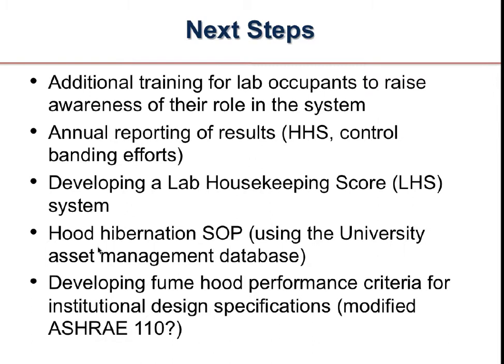We need to continually raise awareness of the lab occupants' role in the system. It's amazing how little lab folks understand what their ventilation is supposed to be doing for them. We want them to let us know when something doesn't smell right in their space. If we do go in and control band and reduce the airflow in the space, we want the lab folks to understand that they have a role to play if something doesn't seem right in their space anymore.